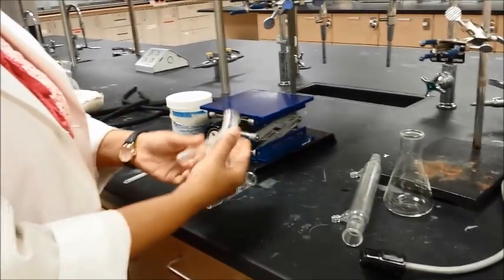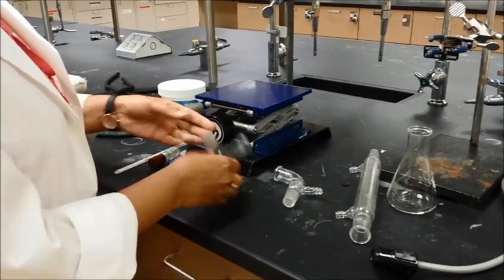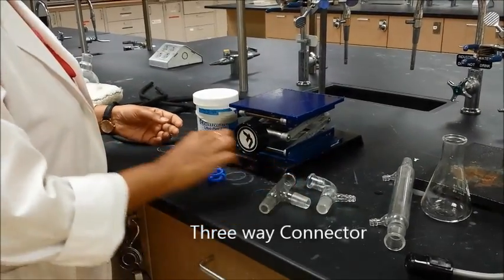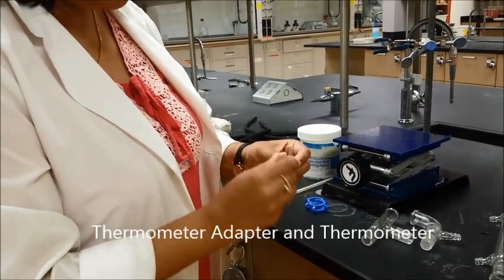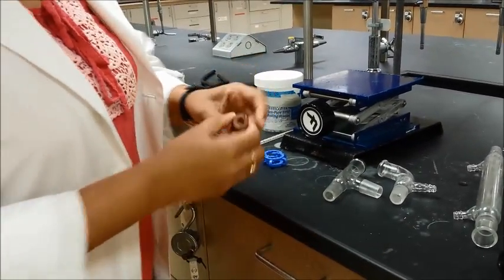You will also need a vacuum adapter, which looks like this. And then you will also need a three-way connector like this. You will also need a thermometer. This is a thermometer adapter, and then this is a little connector that goes on the thermometer adapter, so it should be all together.